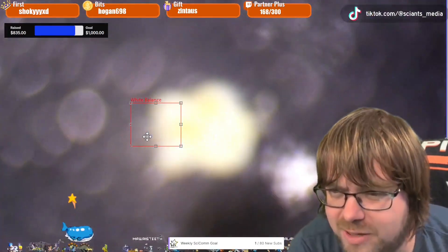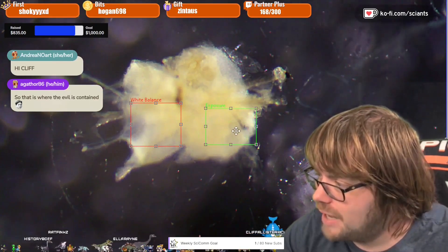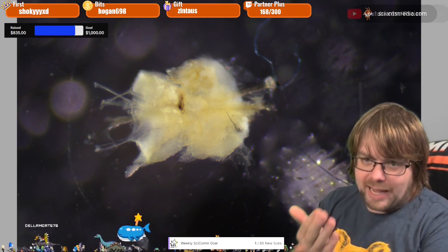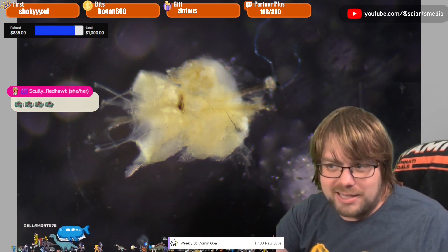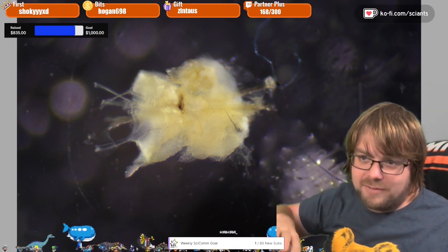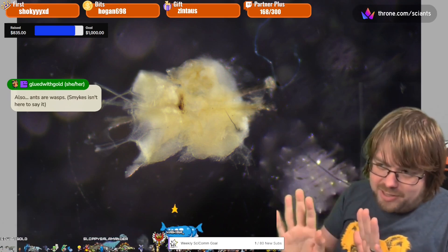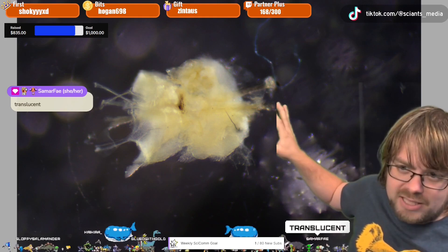There it is - what I am convinced is the first ever wasp brain dissected on Twitch.tv. You might ask: you've never dissected one before, how do you know that's the brain? When you're dissecting an insect head, the brain's opacity - how see-through it is - is pretty consistent between different species. It's not really clear tissue, it's kind of like that patterned glass you have in showers - you can kind of see through it but you can't make out detail. It's that translucency that gives it away.